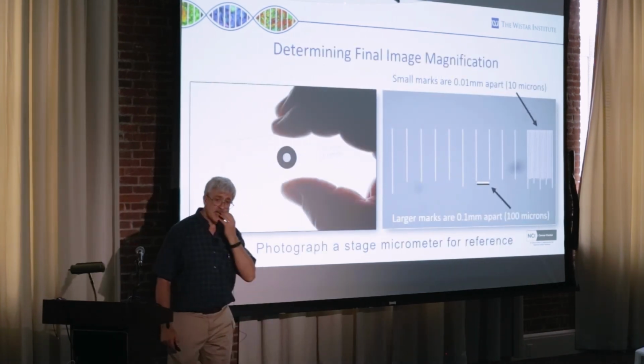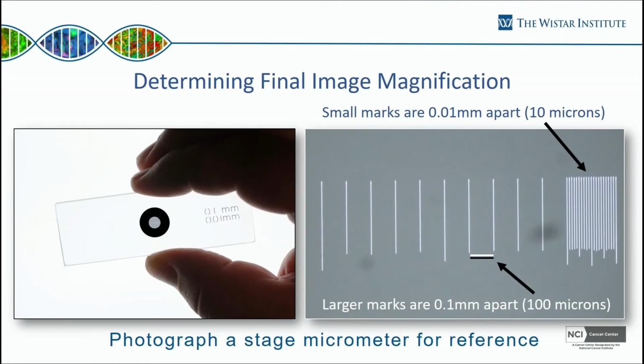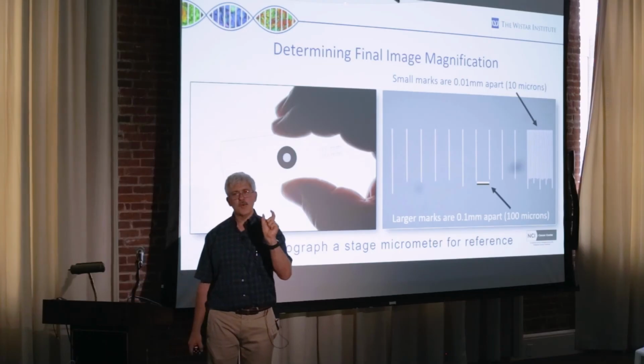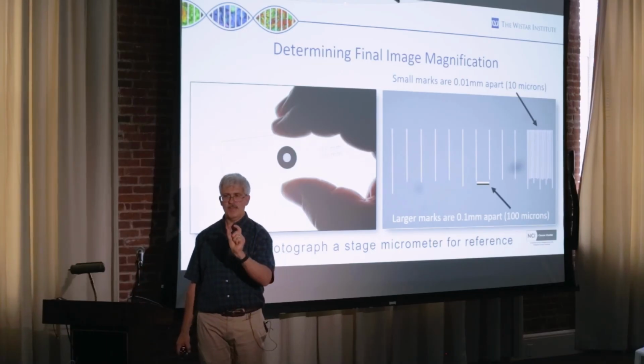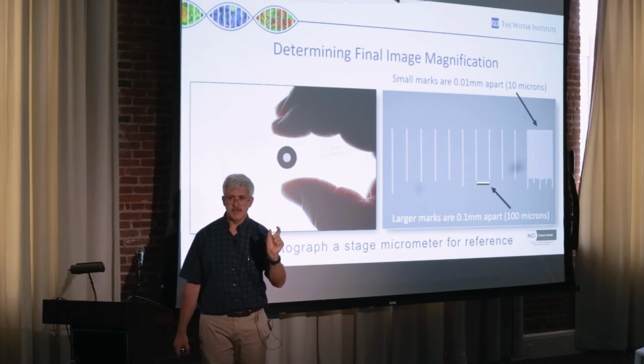I mentioned at the beginning of the talk that magnification is always sort of one of those things about me. People will say, oh, it's 400x, or it's 100x, or it's 200x. Well, to what? All right? In the old days, you could figure out magnification to a 35 millimeter piece of film. But if you really want to go with that model, you need to figure out how big it is on the chip. And all the chips are different.